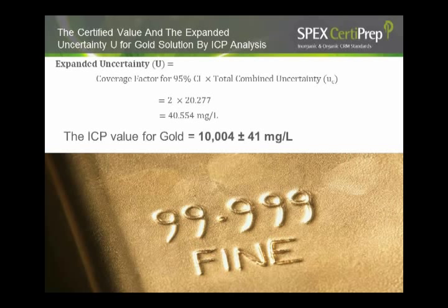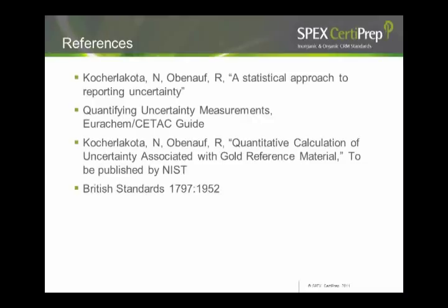Now the third component that we saw in the fishbone diagram was calculation of the measurement uncertainty by ICP. We took 9 different samples, analyzed them, and we found an average of 100.985 by the ICP measurement. The standard deviation for the whole process was 0.29397. So this is a type A uncertainty, and so you would apply this equation, and you arrive at the relative standard uncertainty by dividing the combined uncertainty by the value 100.985. So this also will be used later on in our process.